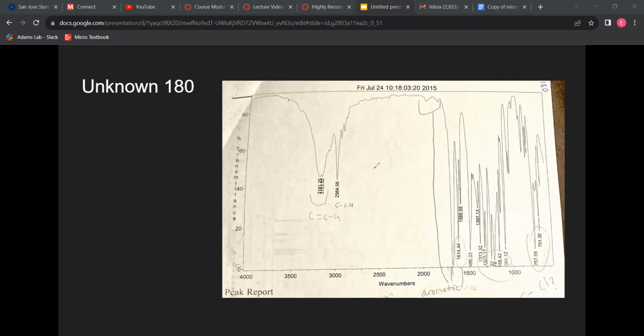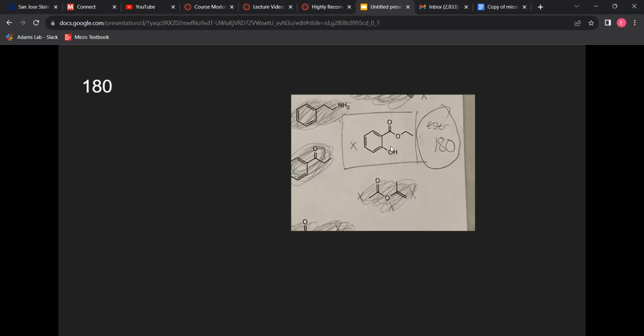From there, I went to the possible list of structures and narrowed it down to first all aromatic structures, then all the ortho structures, also structures with no triple bonds, and then I looked for things that could have an ester and an OH on it, and this one was the only possibility that had not only an ortho substitution, but also had an OH and then the ester filled in up top perfectly.